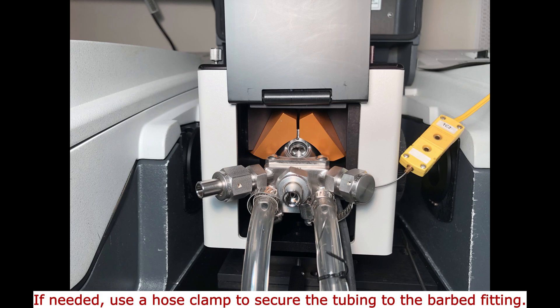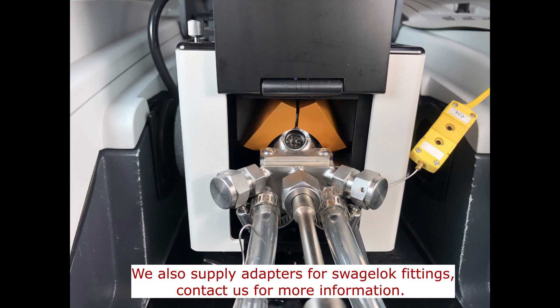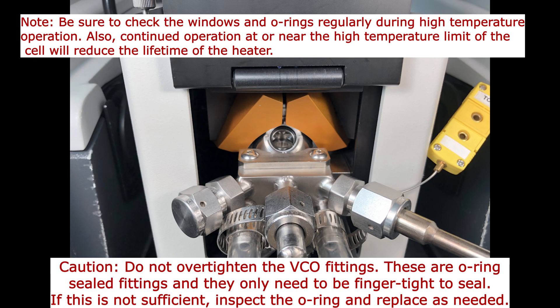If temperature control is desired, connect the thermocouple and heater to a suitable temperature controller. If the HVC is to be operated at temperatures above 100 degrees Celsius, use quarter-inch tubing to connect the two cooling ports to a water inlet/outlet or a coolant circulator. If vacuum is needed, connect the gas outlet to a vacuum pump using vacuum tubing with a 3/8-inch inside diameter, and seal off the two gas inlet/outlet ports. If reaction or process gases are to be passed through the sample, connect the gas inlet/outlet ports to the gas source as needed.